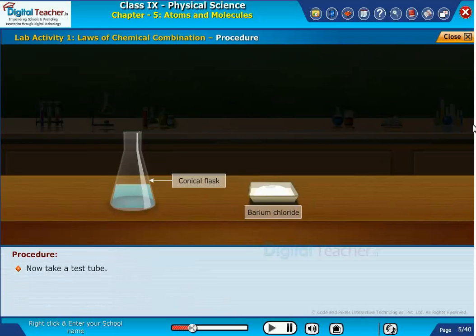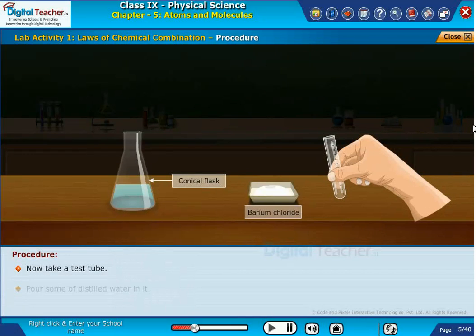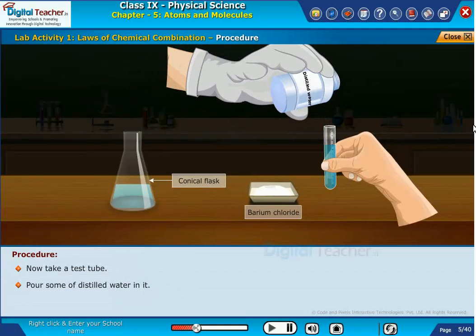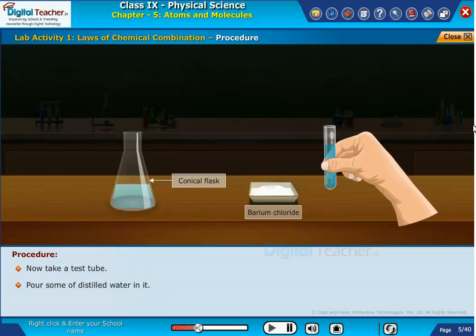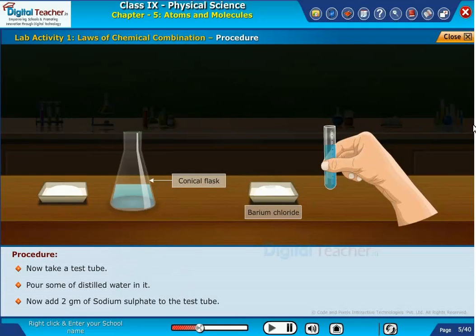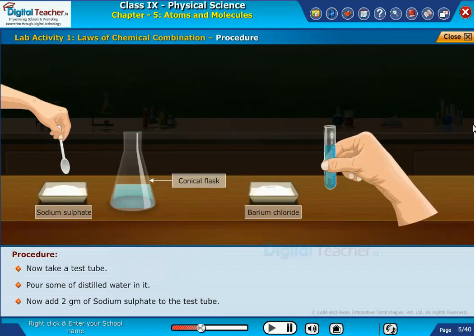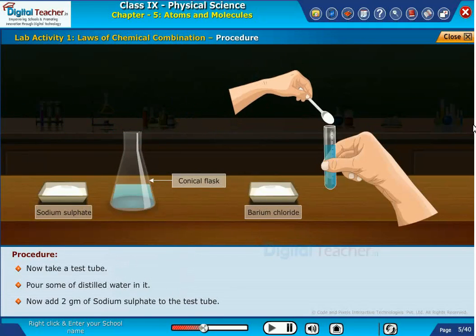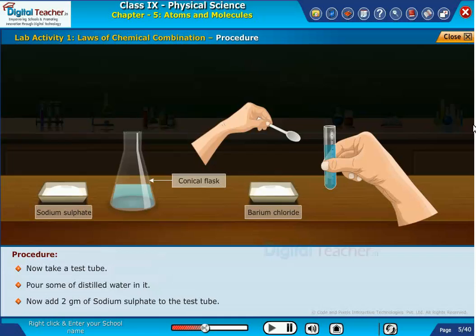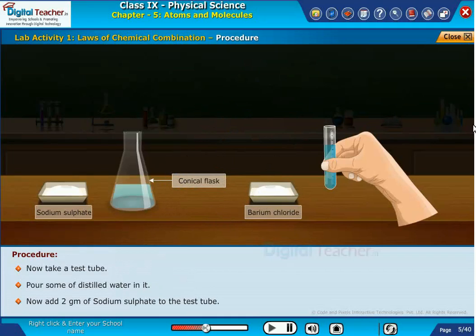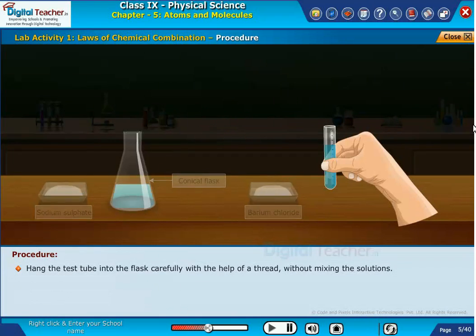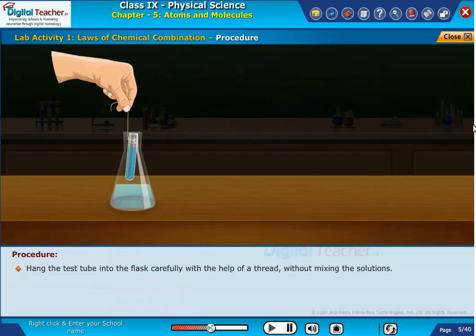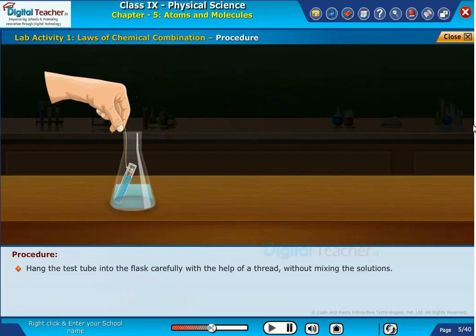Now take a test tube and pour some distilled water in it. Add 2 grams of sodium sulfate to the test tube. Hang the test tube into the flask carefully with the help of a thread, without mixing the solutions.